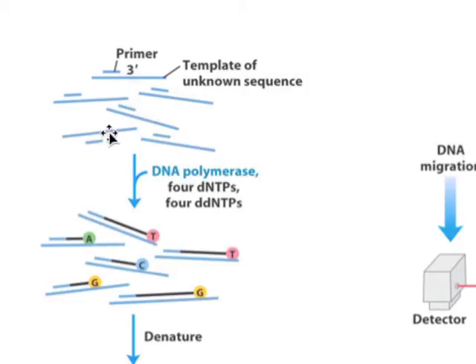Now, the difference here is that when we add in our enzyme and our dNTPs and then our dideoxy-NTPs, we add them all together in one reaction. Okay, now how are we able to do that?